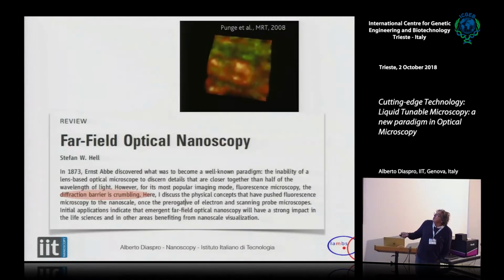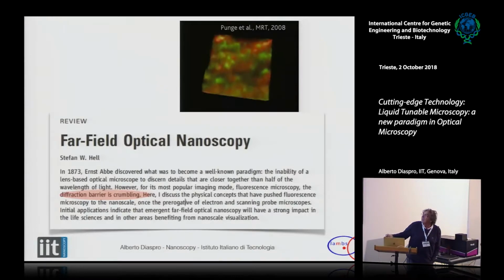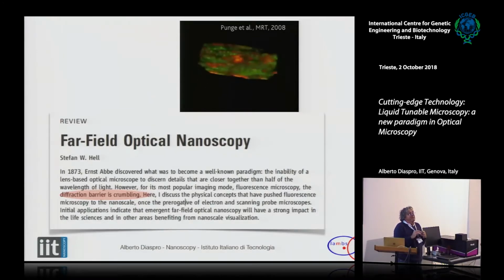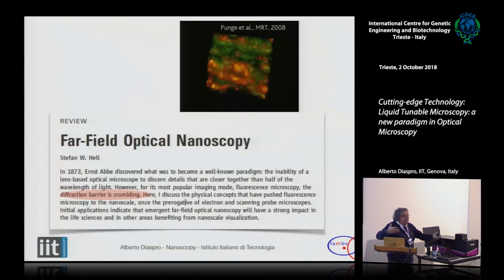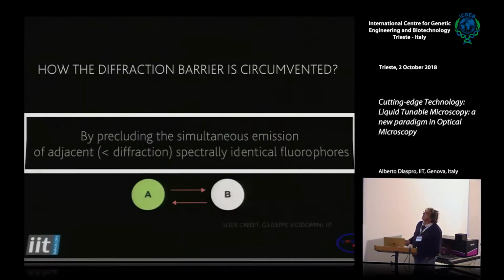Super resolution, you know, maybe you read this paper, and here there is a very nice sentence. I like this sentence. I find poetry in this sentence. It's the first time people are using "the diffraction barrier is crumbling". La barriera di diffrazione è sgretolata. It is the idea of Giuliano Parodi di Francia. Doesn't matter. We don't mind about the diffraction barrier. We have additional things to put in the image formation process. This is the reason why we get it.